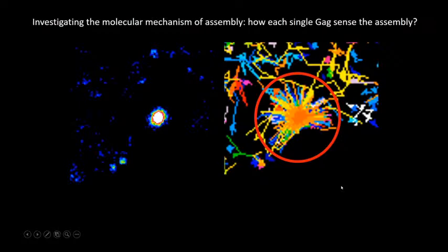The issue with that kind of behavior is that it is very difficult when you perform tracking, whatever the algorithm you use, even if you use the famous and very good multiple trajectories software from the Marguet team in Marseille, it is still difficult to know if these connections are linked to the local density, or if they really describe the trajectory of one single particle.